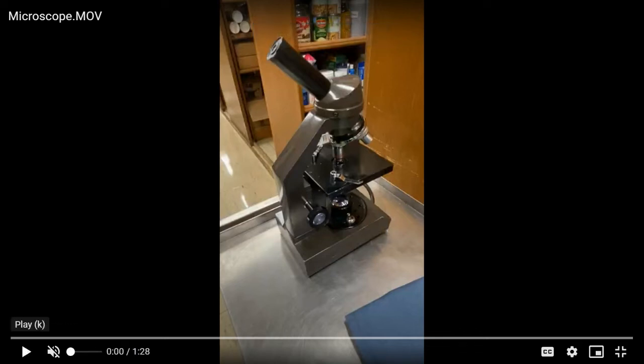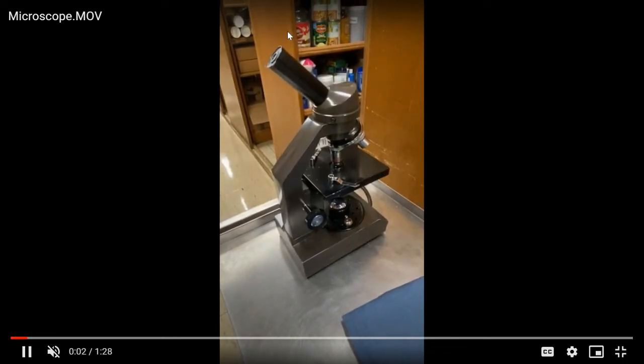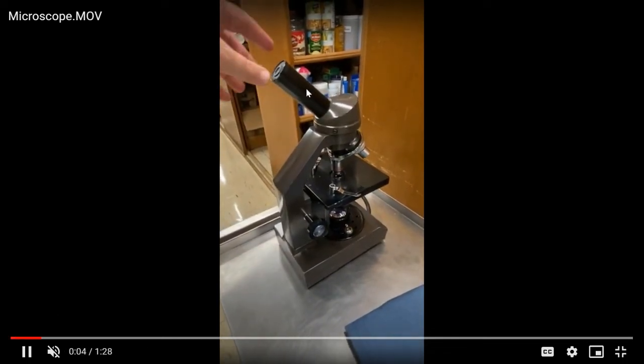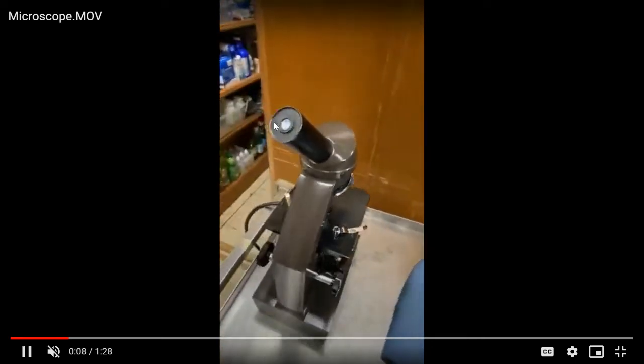Okay, here is the compound microscope we're going to be using for our lab this week. Up here at the top, this is the eyepiece. This is what you're going to look through. It has a magnification of 10x. You'll see that here on the lens.